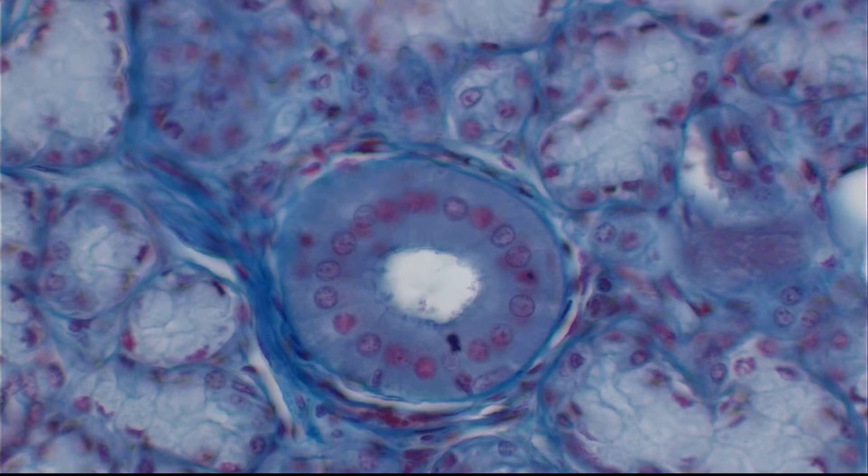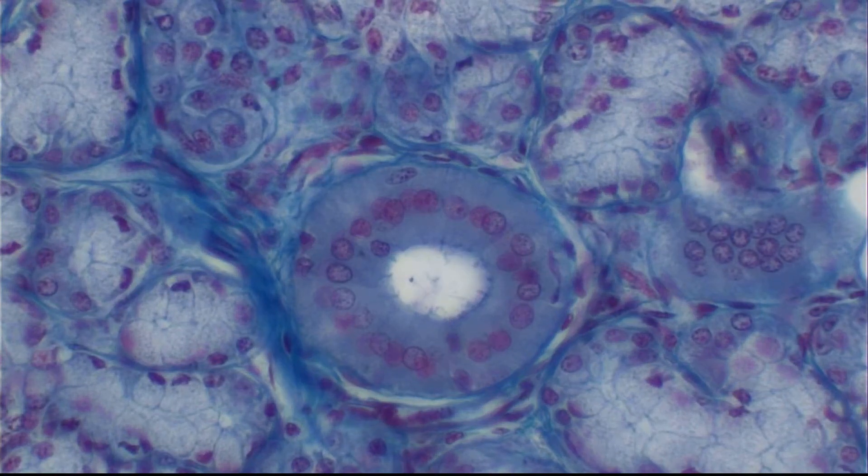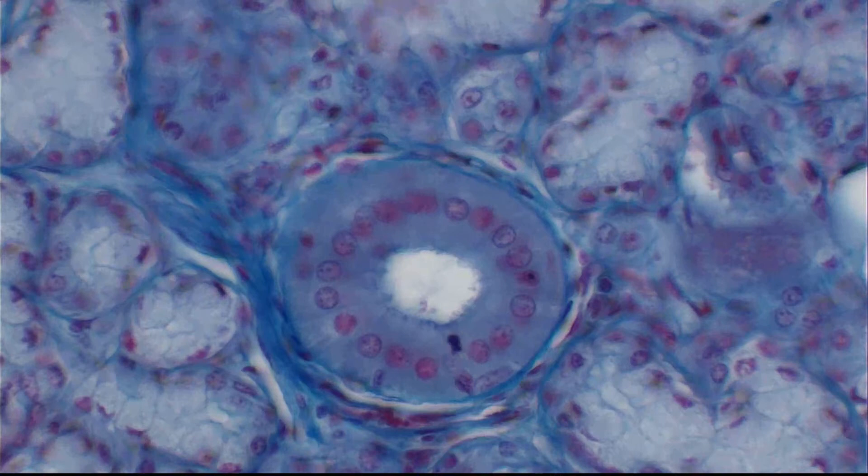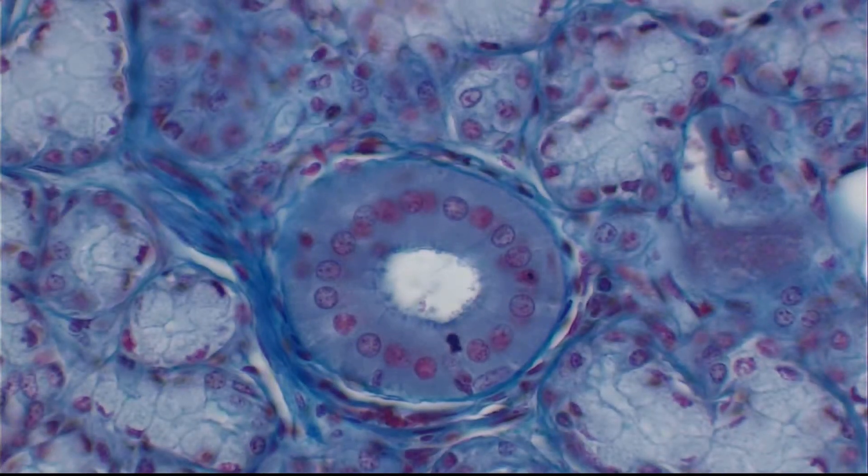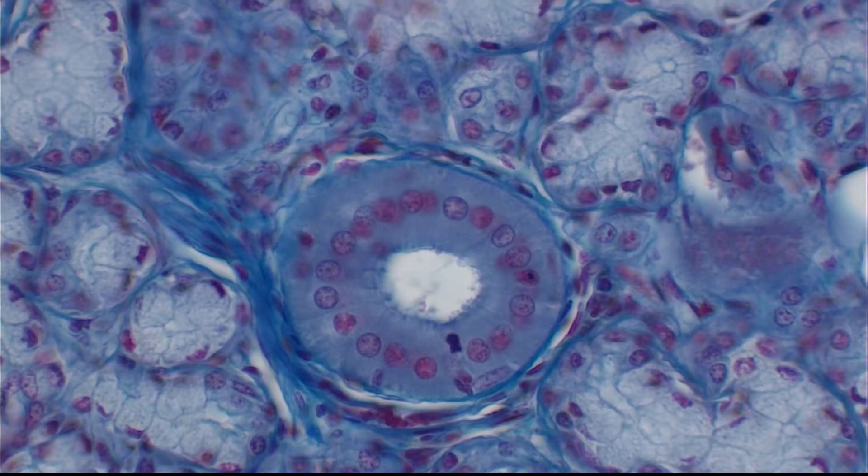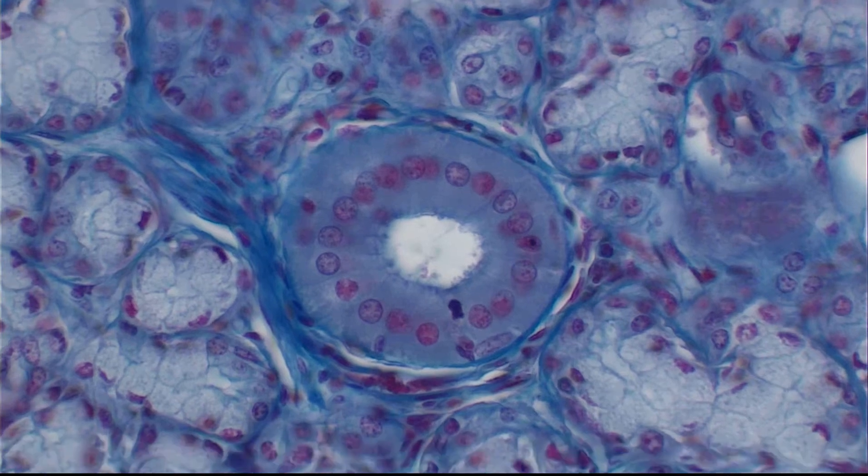Using a high definition camera and routine ordinary microscope, this technology allows seamless streaming of HD video in glorious color with very little latency and very little pixelization.